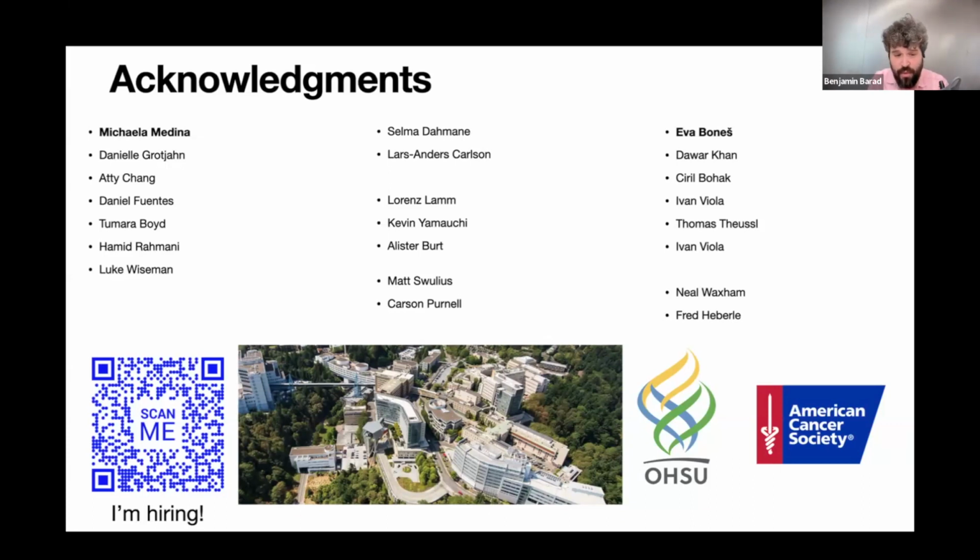Some of this is limited by the way that we do cryo light microscopy. In particular, we're limited to air objectives, which makes a lot of the super resolution techniques quite difficult. I think that over time, this is going to get easier. There are super resolution techniques like STED where it would be possible to get much higher resolution. And I think it will be very interesting to go back once there are workable cryo-STED approaches or other cryo super resolution approaches to do the kinds of fluorescence approaches that you're looking for.